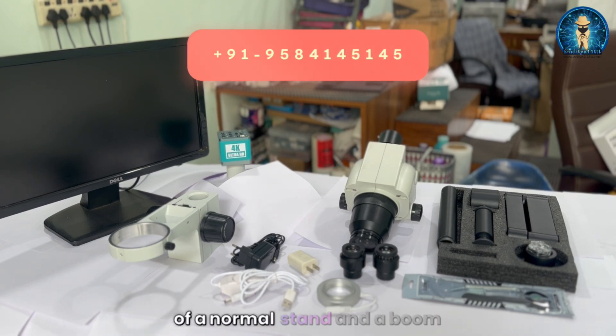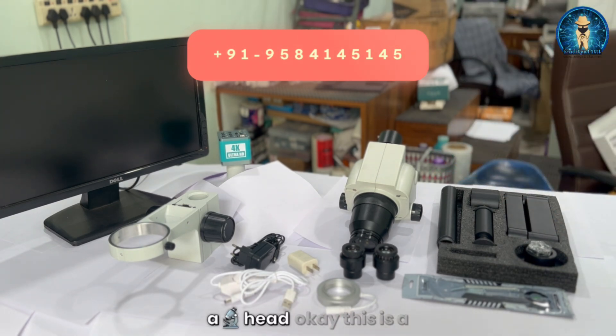The basic difference between a normal stand and a boom stand is that you have the flexibility of movement in the stand. There are various types of stands coming into the market that you can use as per your need, requirement, and space. We will start the video with the introduction of the set available in front of you — here you can see this is a microscope head.